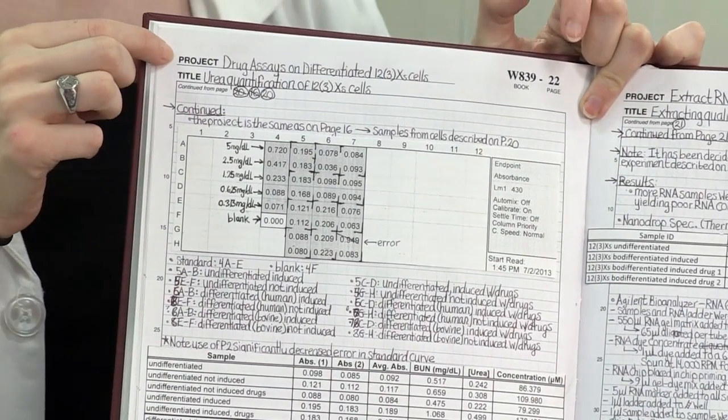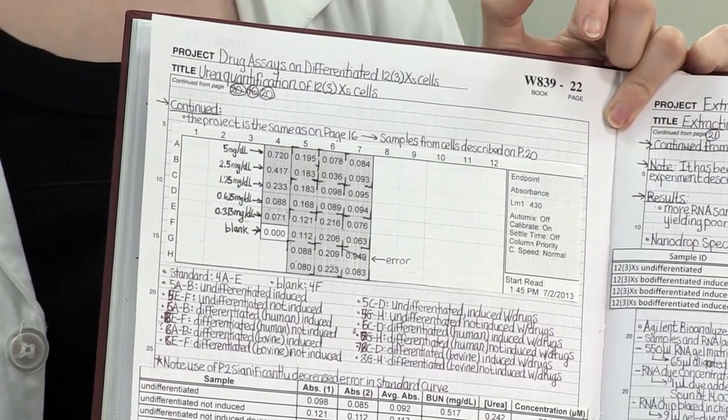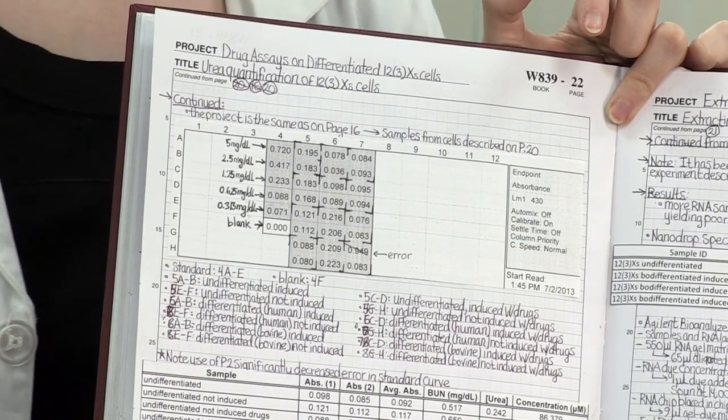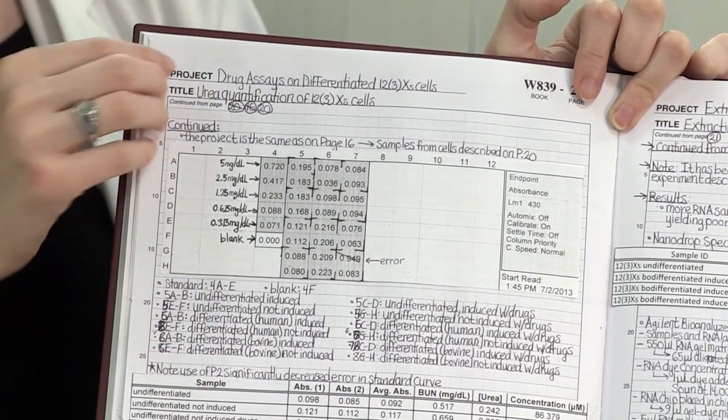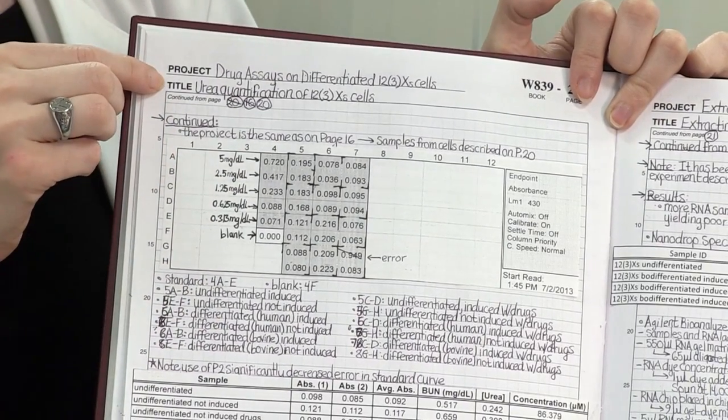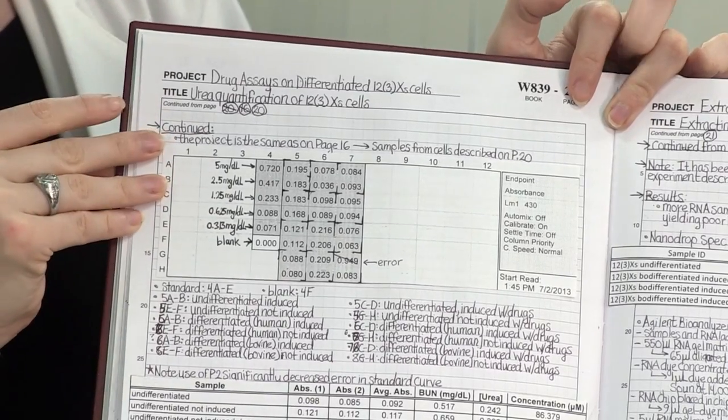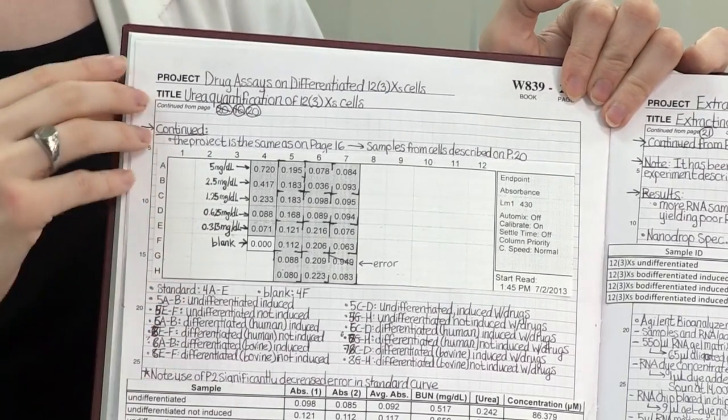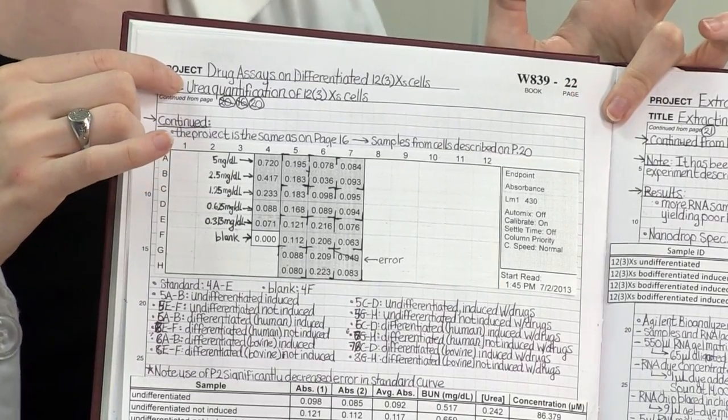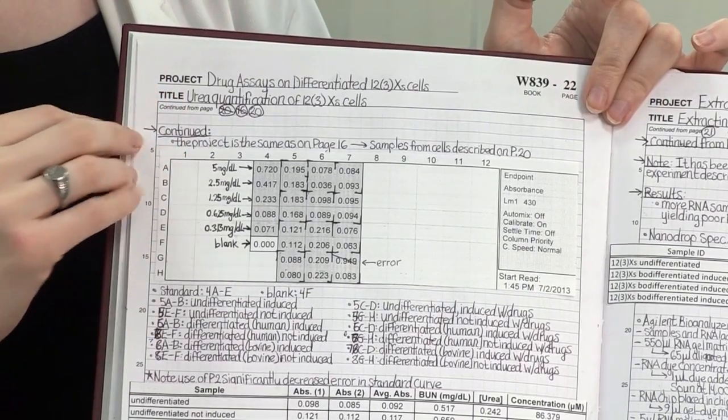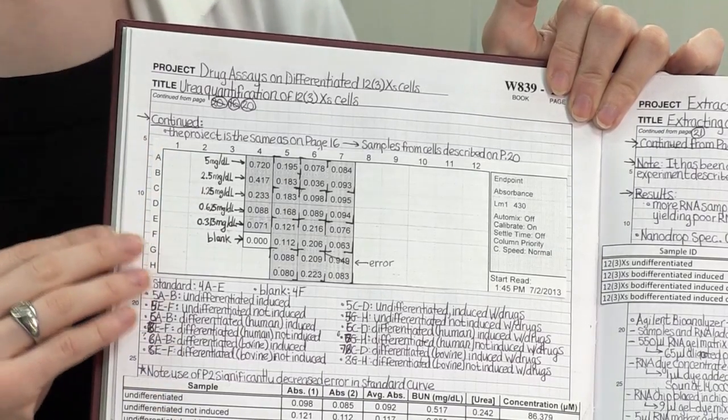So the project is really important because that will allow you to differentiate between different projects that you might be working on. Sometimes you might be using the same assay for a different project and it helps differentiate. It's also really important to have a detailed title that will help you remember what you did at a glance. So I like to talk a little bit about what technique I'm doing in that section as well as what sort of cell type I'm looking at.